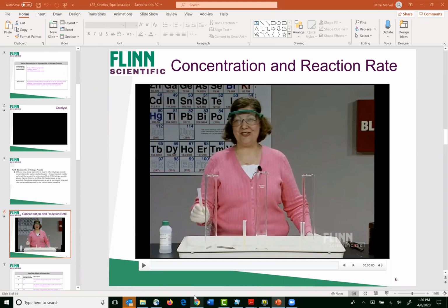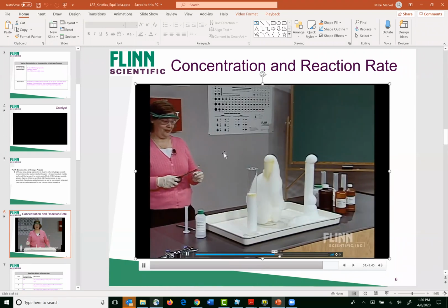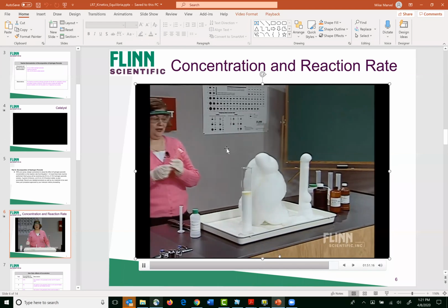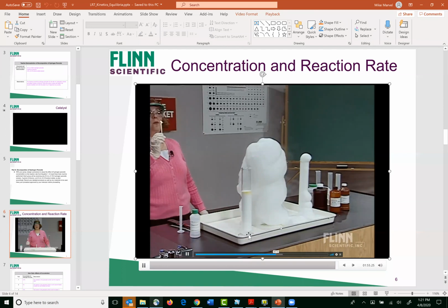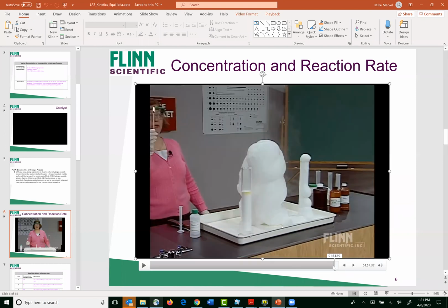Yeah. So the right answer is yes. So let's see this real quick. I just want to fast forward here. I'm going to play you this video. And at the end of this, you'll see Irene here. This is our presenter, and you won't hear audio here, but she's ignited a wood splint. She's going to extinguish it, and she can be rather verbose. And then she's going to place it back in, and I think I stopped the video there. She's going to place it back in.